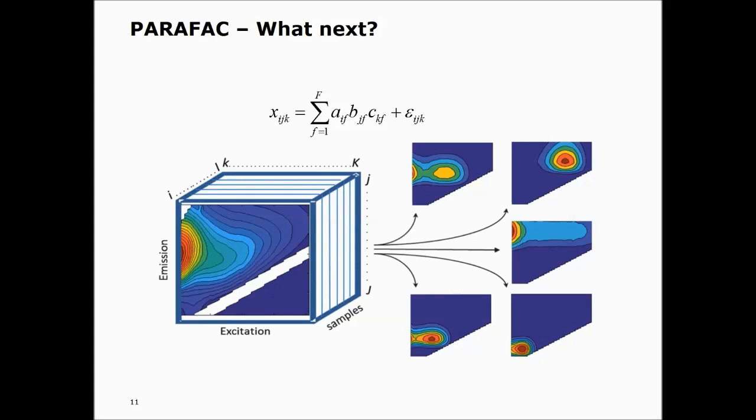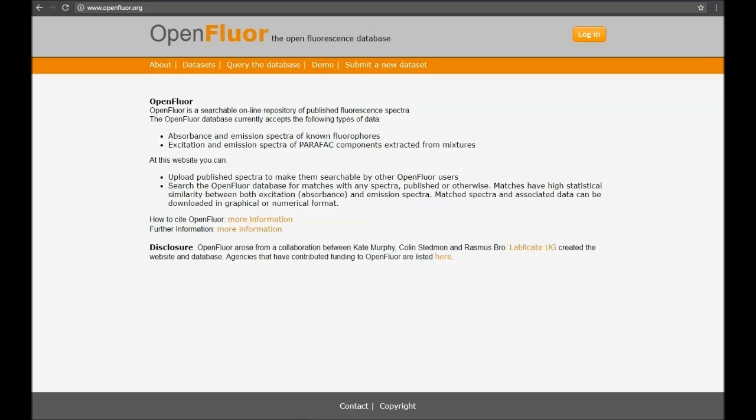So the next step is just a short demonstration of the OpenFluor database. Okay, so now I will give a short demonstration of the OpenFluor database.